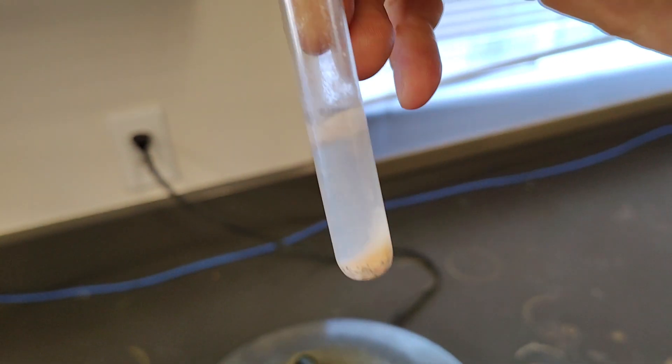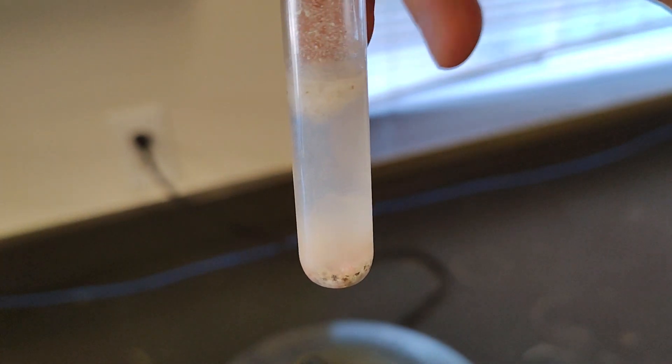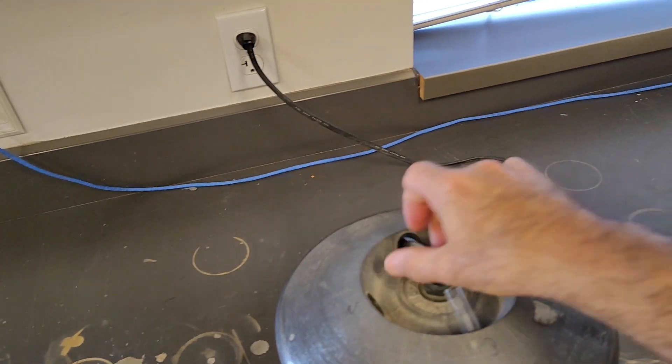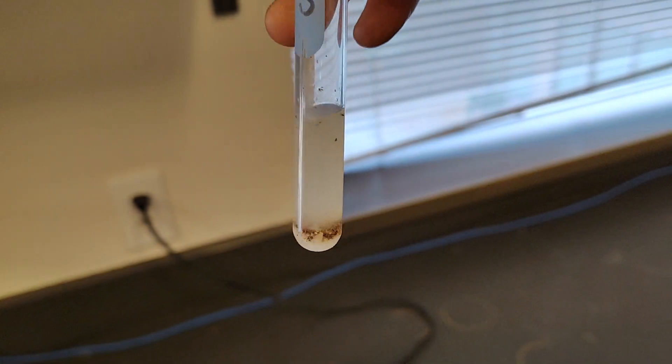So I've got the particles there. Look at that. I've got the lighter particles up top, the aqueous solution in the middle, and at the bottom is the solid heavy particles. So that's this one. And then the other one actually separated a little bit better.